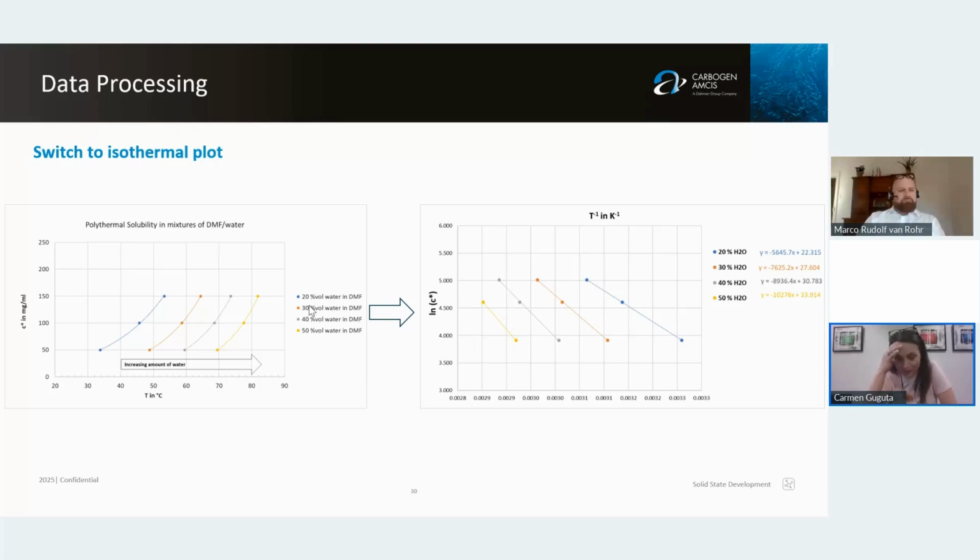And with the Crystalline, there are quite a few methods developed on how to look into anti-solvent type of crystallizations. If interested, Ankit, look on our website, crystallizationsystems.com, under publications, select Crystalline, and you'll see there the white paper on solubility. And there for sure we'll have a chapter detailing that. Now, going back to what I'm reading to you, Marco. Thank you, Marco, for the great presentation.